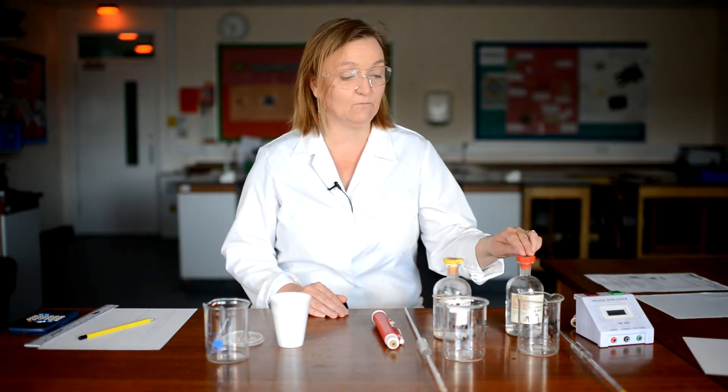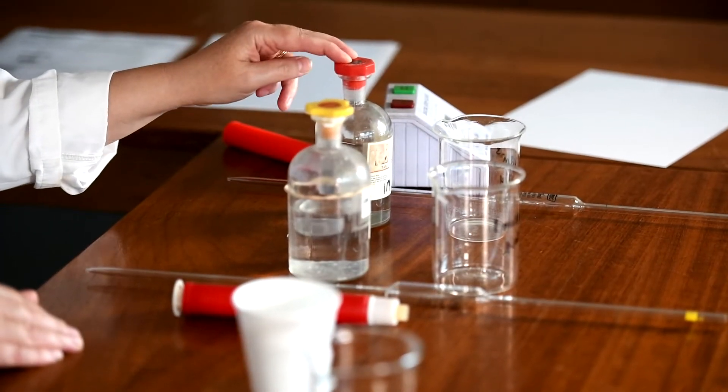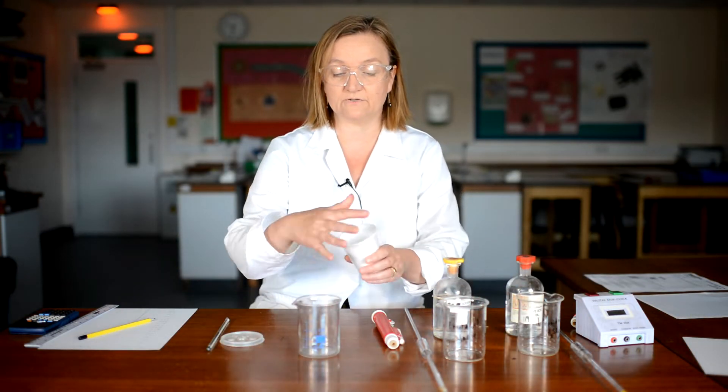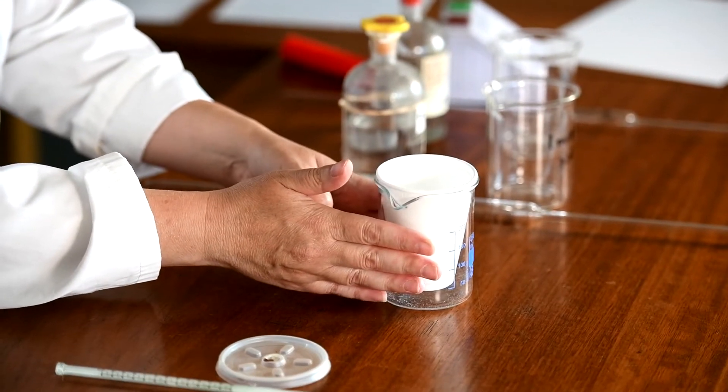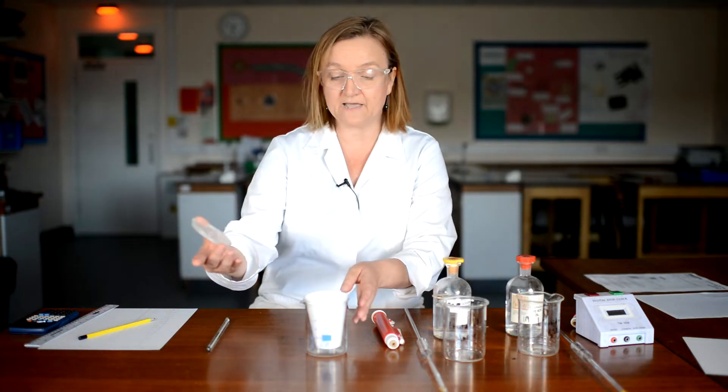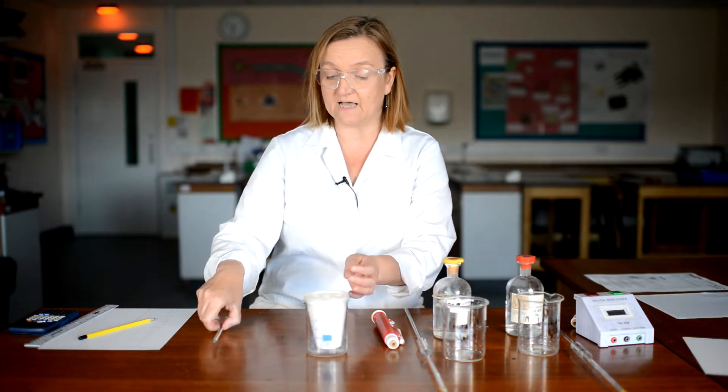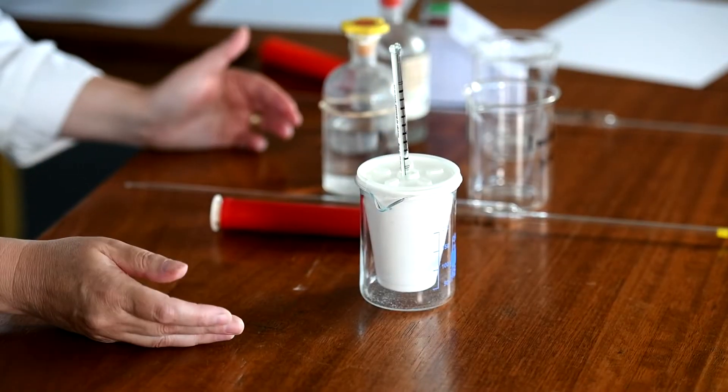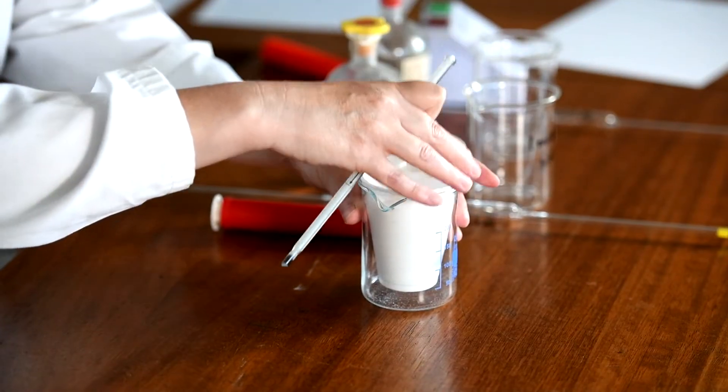I'm going to do this experiment by reacting together one molar sodium hydroxide and one molar sulphuric acid. I'm going to do it in a very simple little calorimeter made from a polystyrene cup which I'm going to sit inside a beaker just to make sure it's stable, and then I've got a lid for the top and I'm going to take the temperature during the neutralisation reaction with a thermometer.